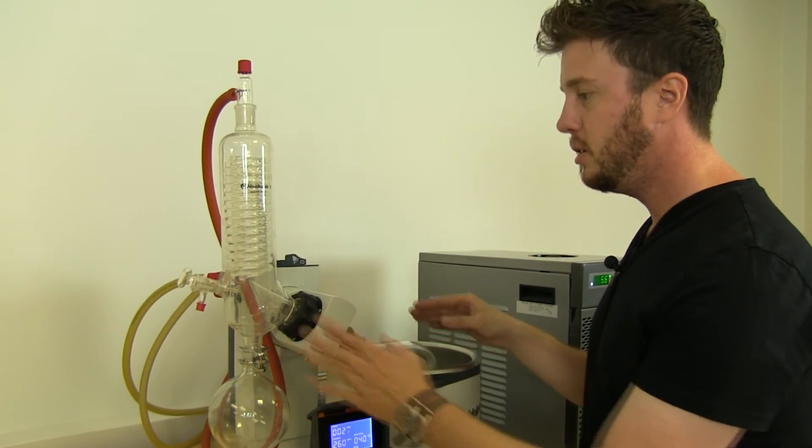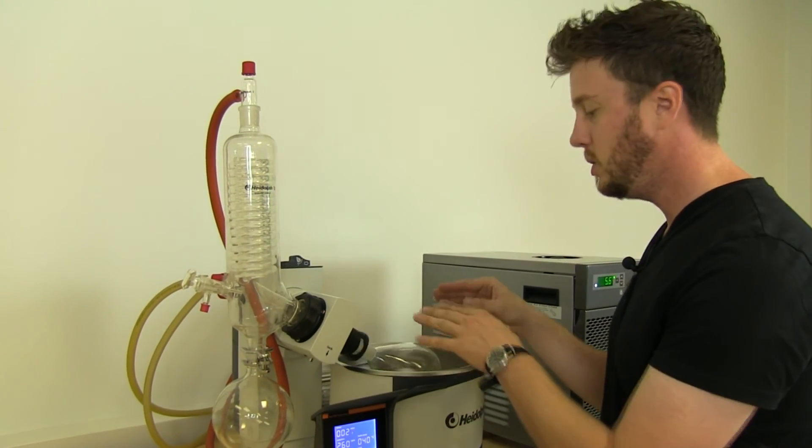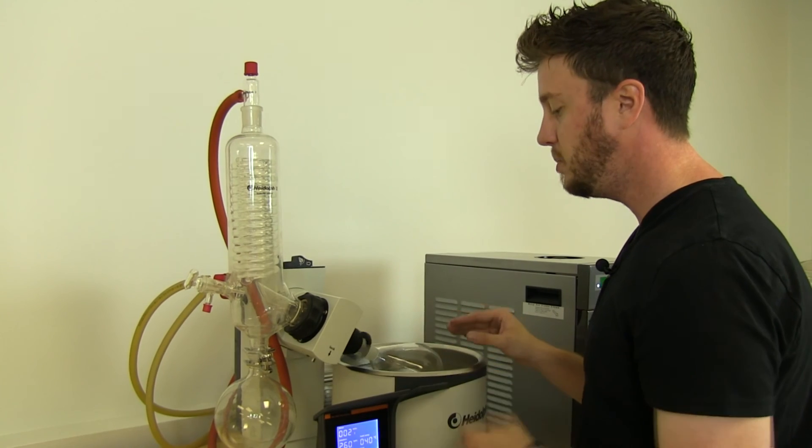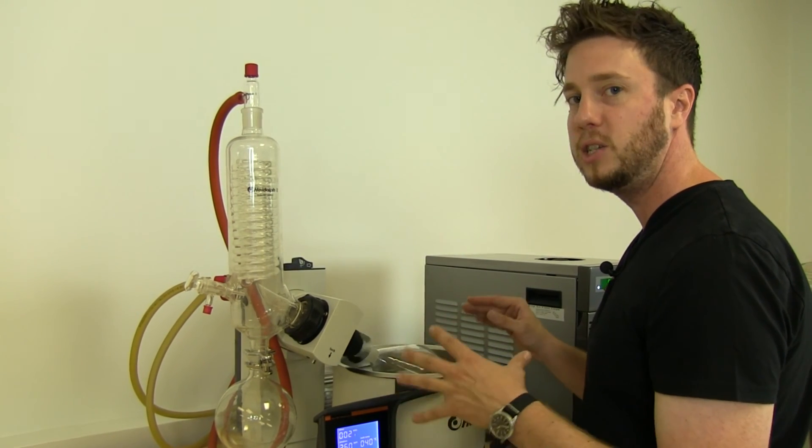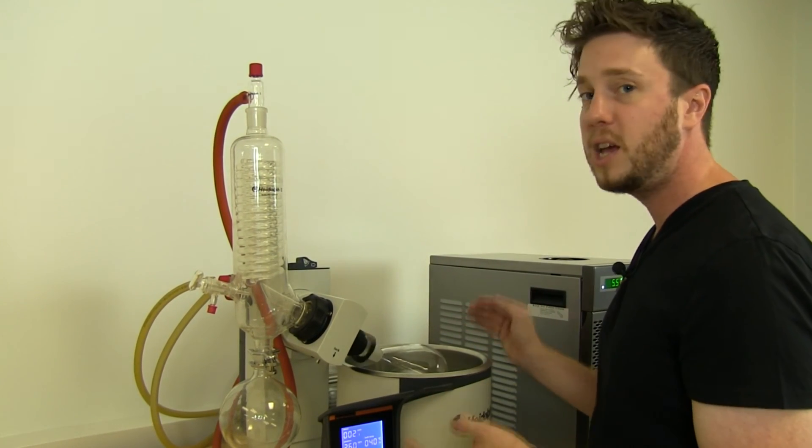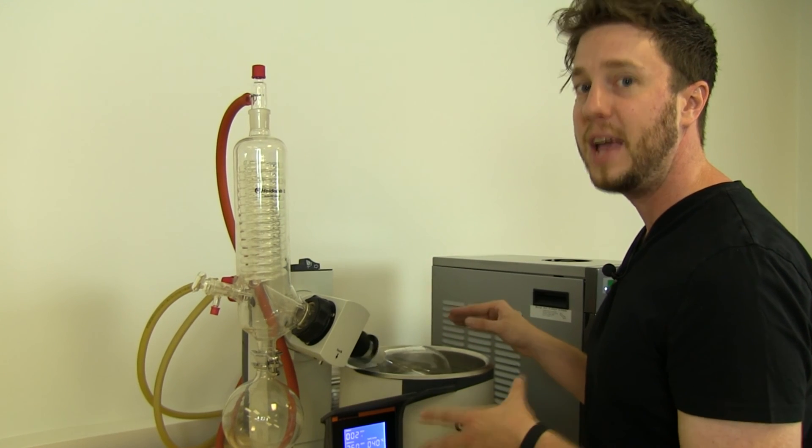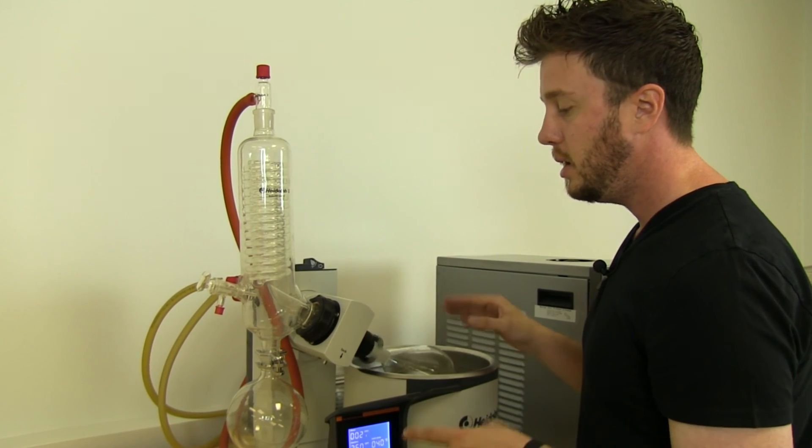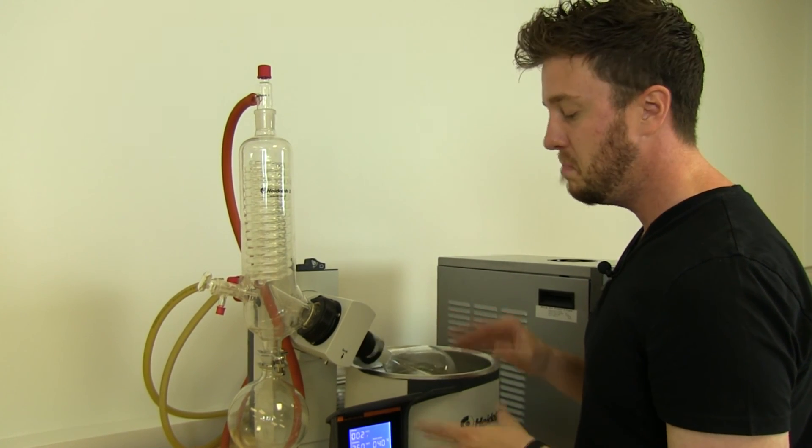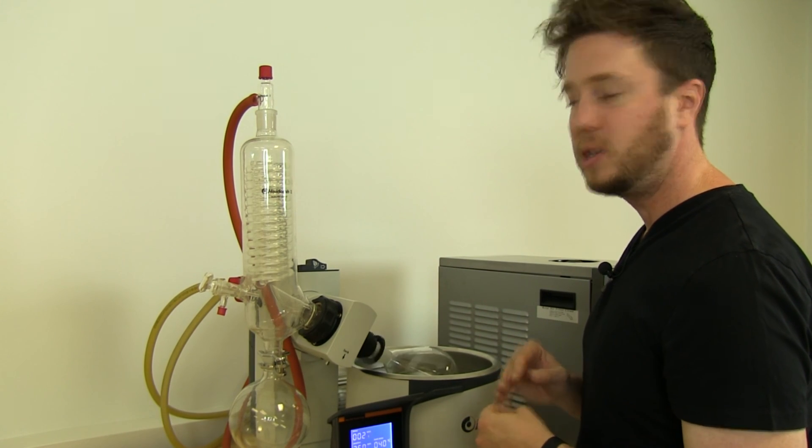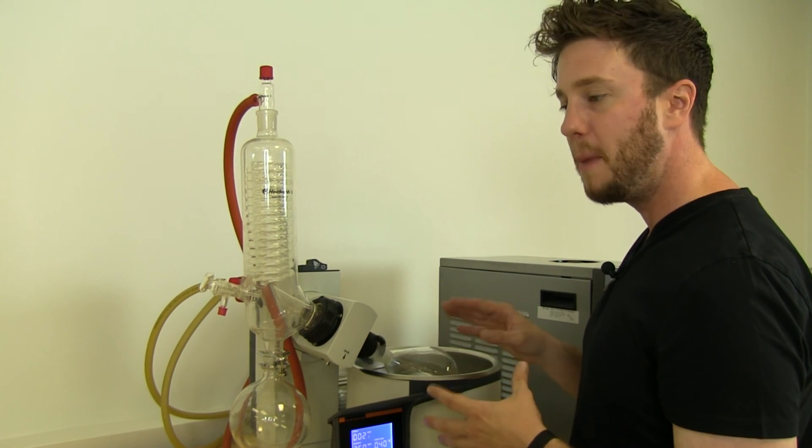But if you lower your temperature, lower your vacuum pressure, you can slow this process down. Some chefs prefer to have a nice gentle distillation that can take upwards of six, seven, eight hours. Most distillations, however, two to three hours is typical for about a liter.